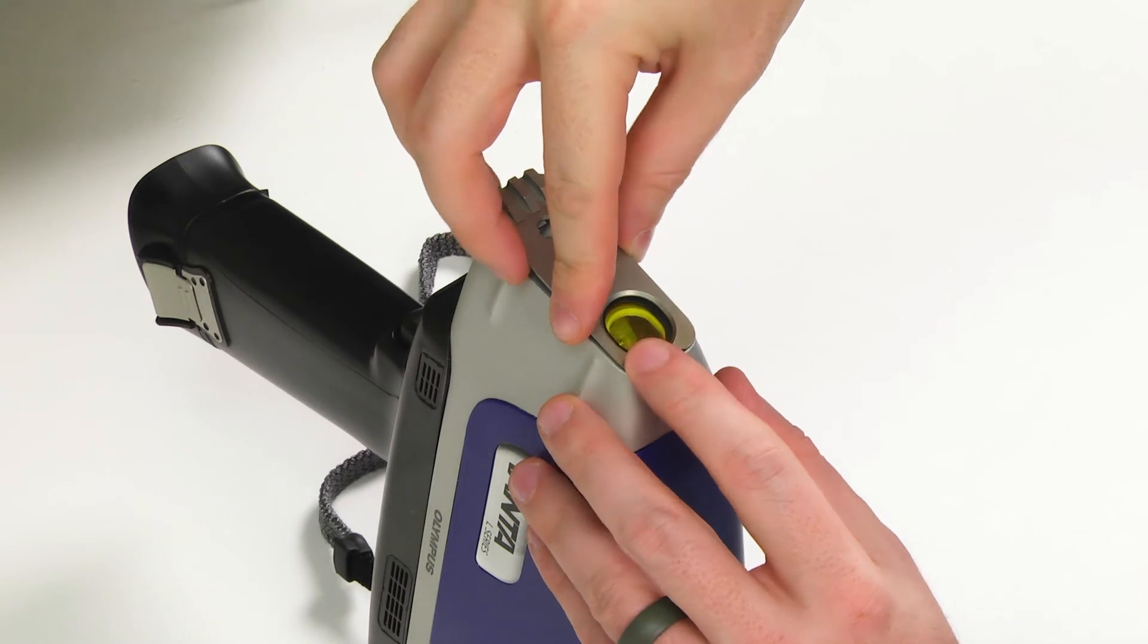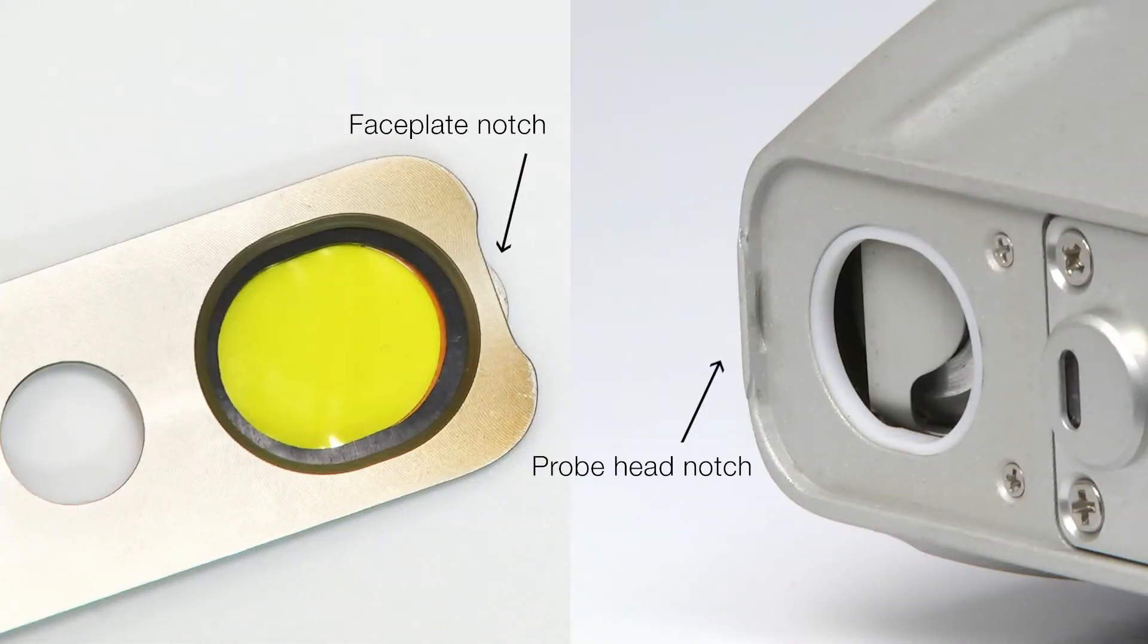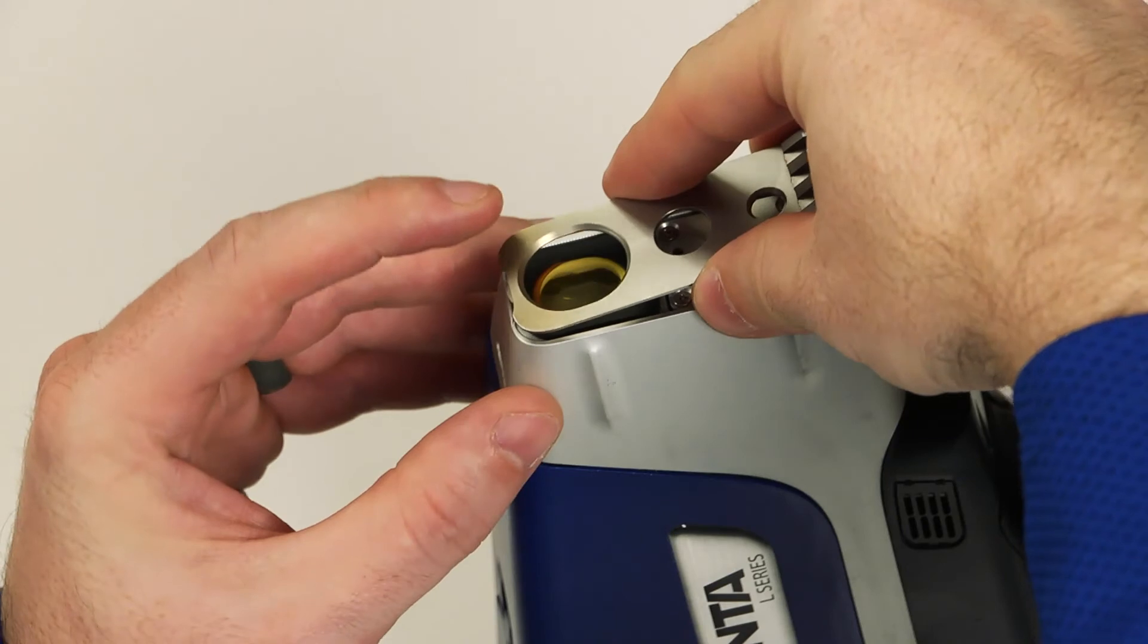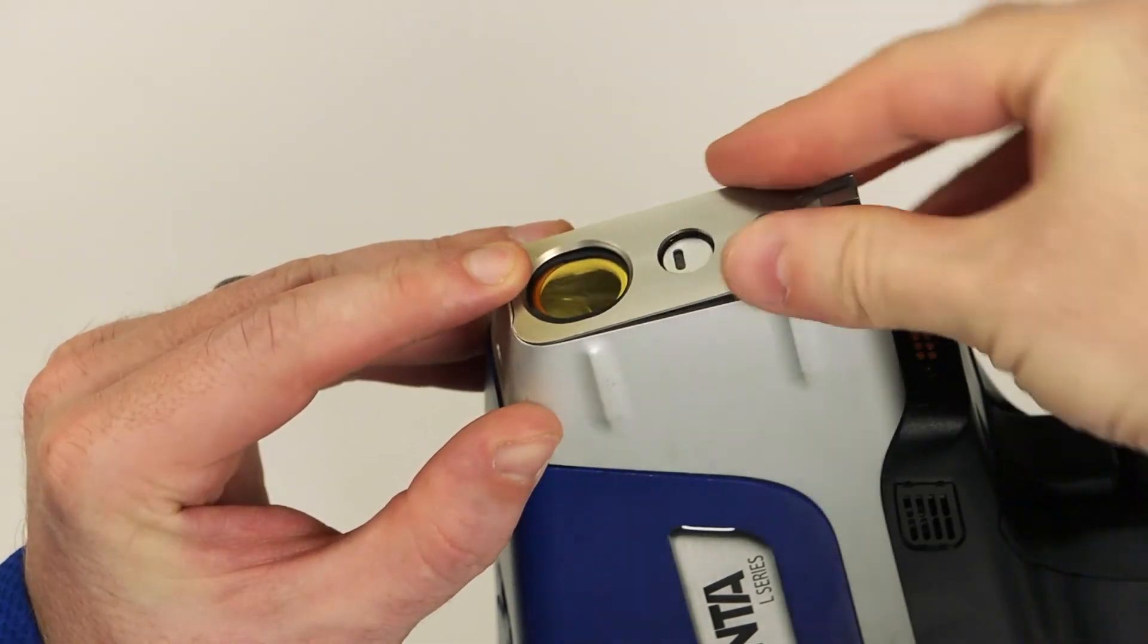Snap the hot heel faceplate into place by sliding the notch at the top of the faceplate into the notch at the top of the probe head. Gently press the bottom until you feel it click into place.